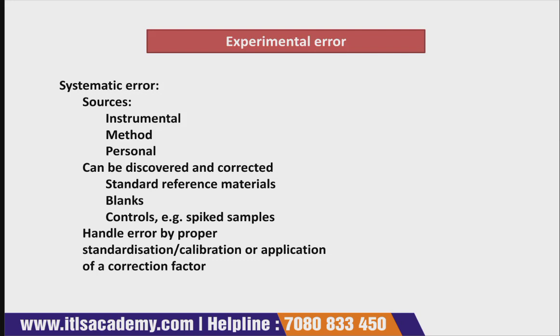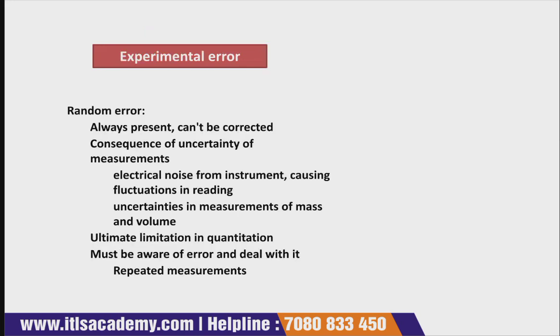Handled error by proper handling: it is always recommended, to avoid this huge range of error, that the material or the process should be handled in a very aseptic environment, as well as with very close observation. So these are the systematic errors.